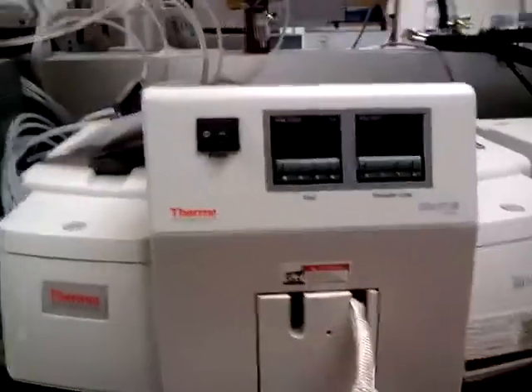Okay, yeah, just cut back around here. I got some gas. Gassy. All right. Another TGA. Okay, different types of samples. Got this one connected to the IR. FTIR. TGA. FTIR.